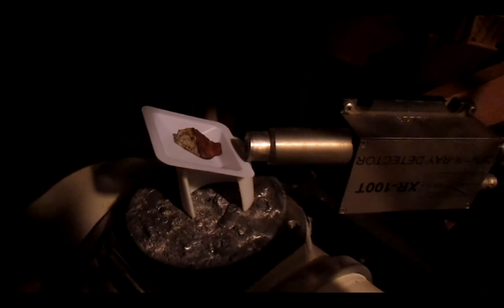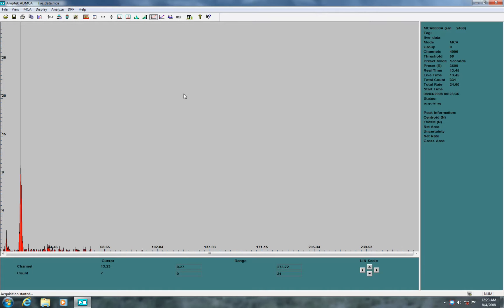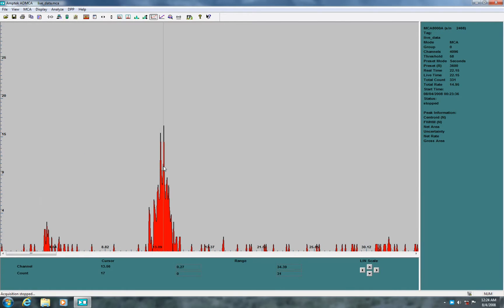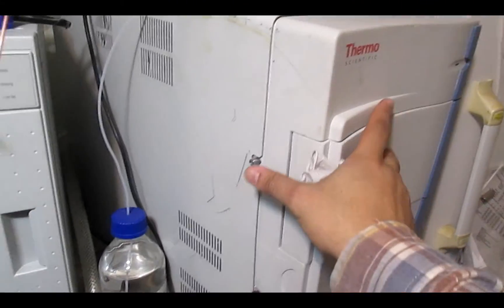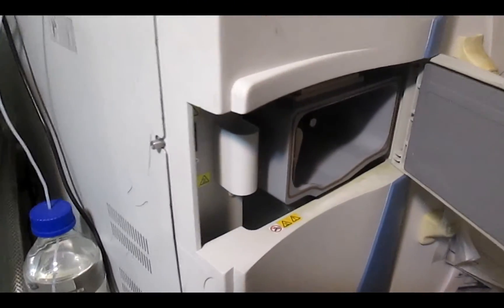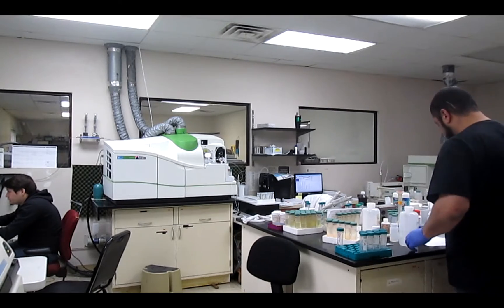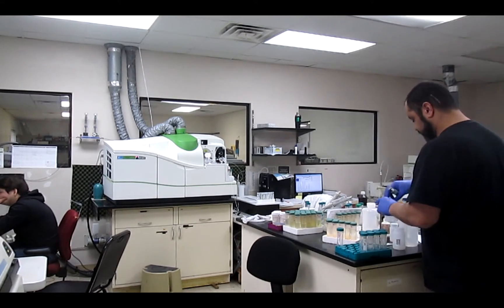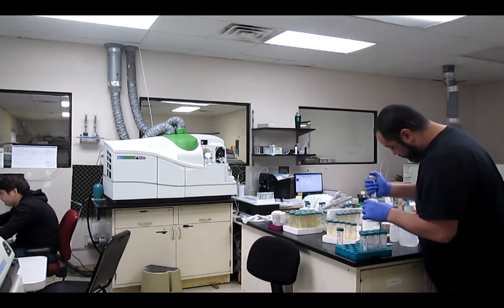For now, neither of these meteorites displays any radioactivity, and the XRF reveals iron and nothing else. Looking for trace metals and isotopic ratios in the parts per billion and trillion range is a job far beyond my mass spectrometer's ability, so I called in a favor from a friend at my old lab and used their triple quad ICP-MS.